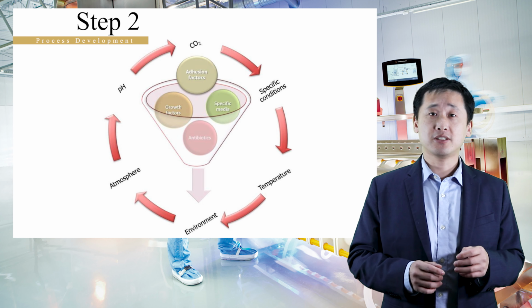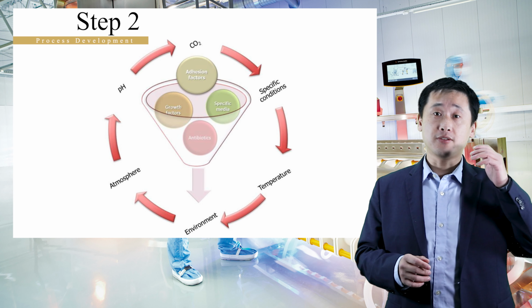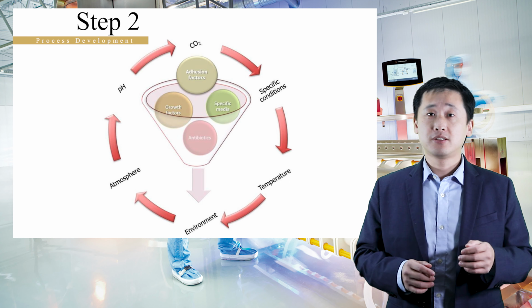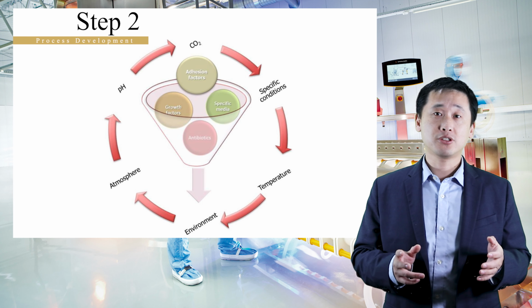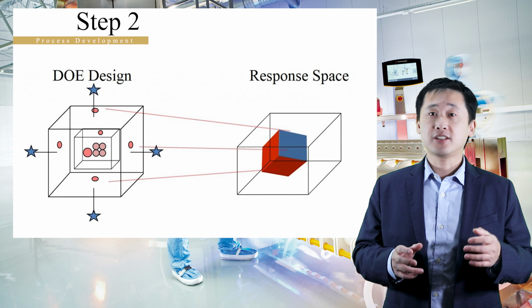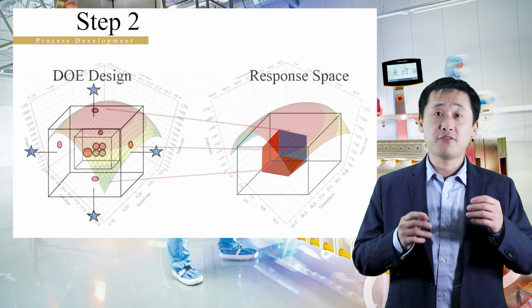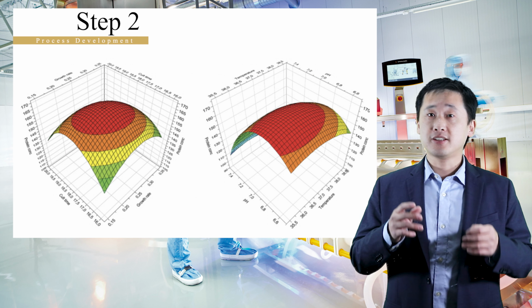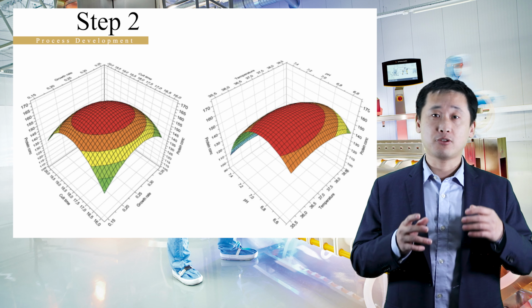Now the development process looks at the characteristics of a cell culture environment. Each cell line responds differently to a given in vitro production environment. So in the process development phase, a design of experiments or DOE is a valuable methodology to organize, plan, execute, and statistically evaluate different variables for the environment.